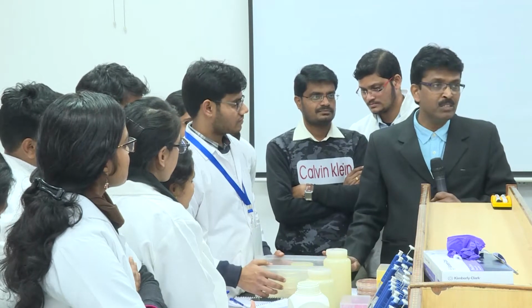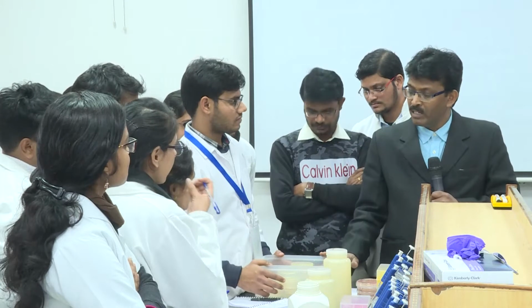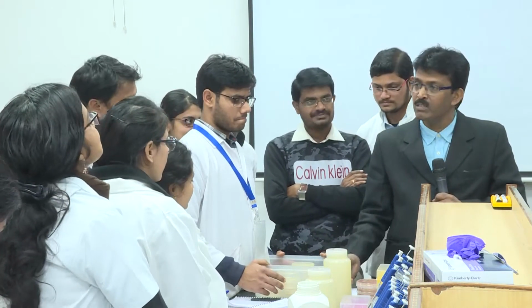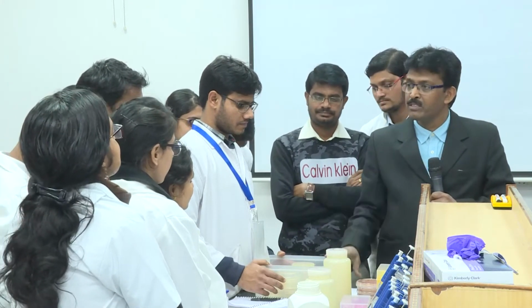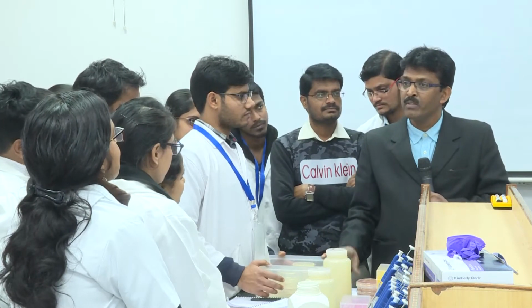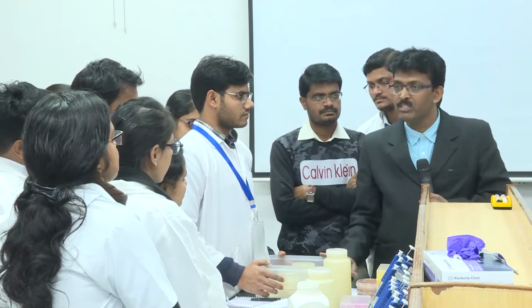Keep it at room temperature, right? Next day you come and you just weed out the plates which are throwing some contaminants. Then take the best plates and take them on board. If it is antibiotic amended medium, you straight away put it in the cold room. You can use it for a week maximum.